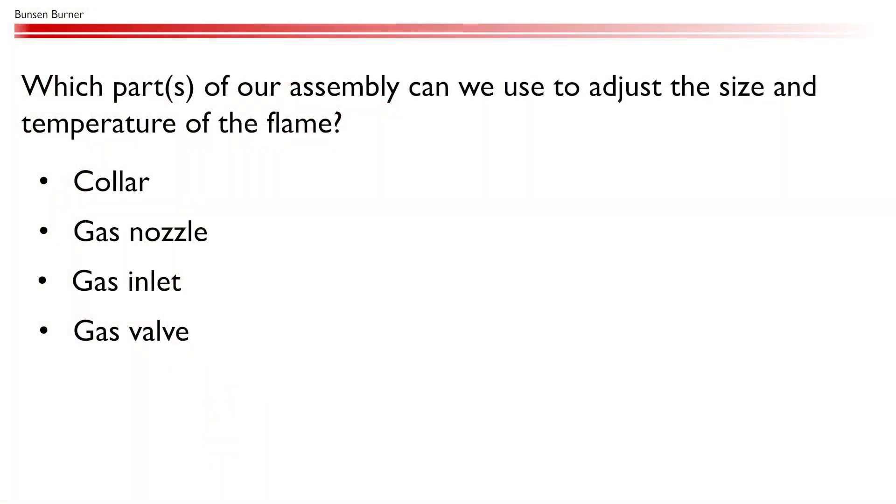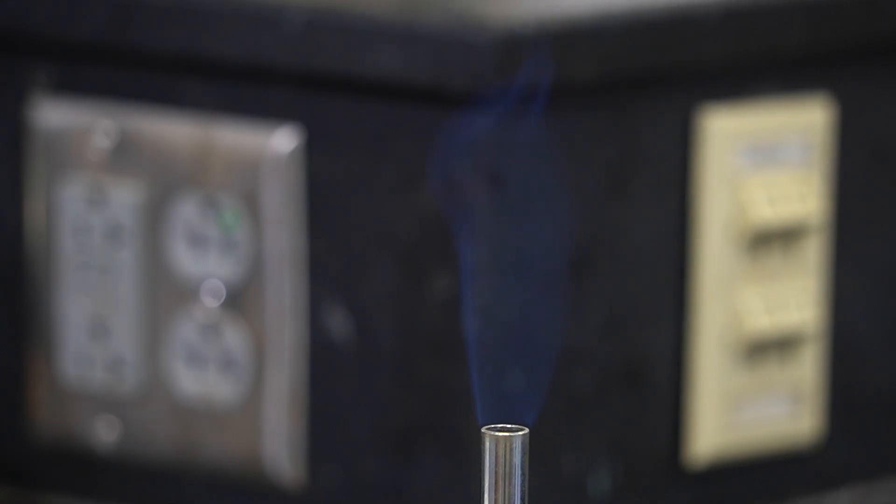Which parts of our assembly can we use to adjust the size and temperature of the flame? Now that we have a nice blue flame, we can continue with the experiment.